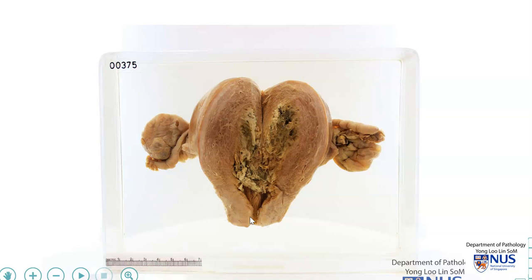Looking at this specimen, there are two major abnormalities that stand out. First of all, the uterus is large. It is enlarged if you look at the scale here, with this being the 7 centimeter mark, and the myometrium is also thickened. This could be attributed to a state of pregnancy, although this is an abnormal pregnancy.